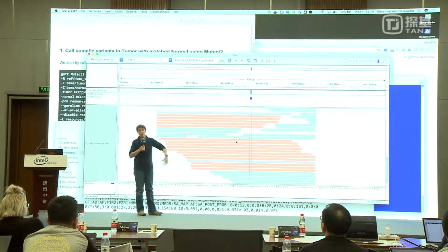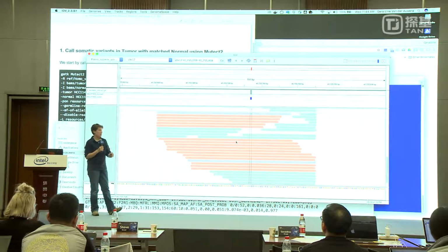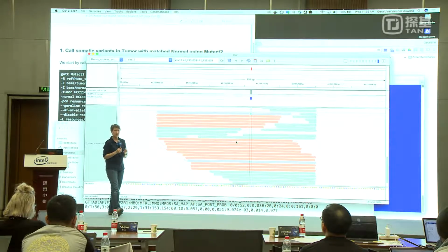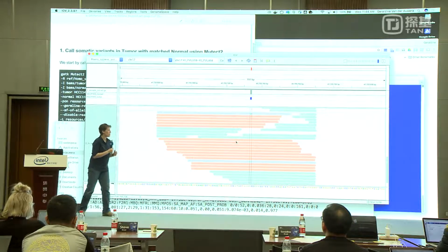In the germline context, we would just say, oh, that's an artifact and get out of here. In the somatic context, if we want to be very sensitive, we are going to accept that and say, okay, I will emit it. Honestly, it's so low that it's more probably an artifact at that point. But I can't dismiss it because it is possible that it's a low frequency event.